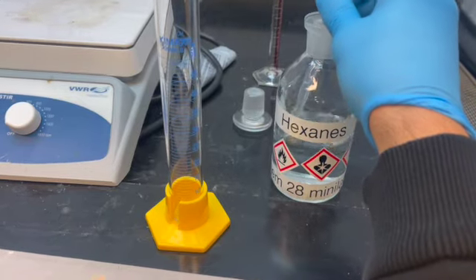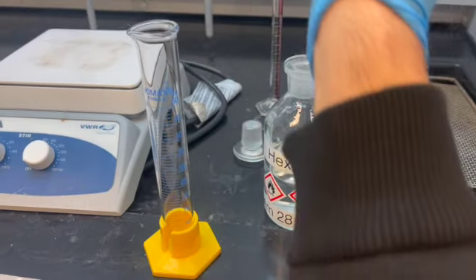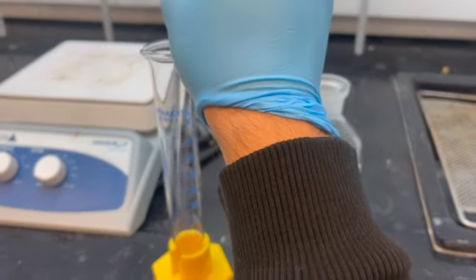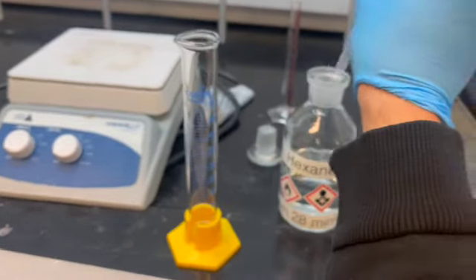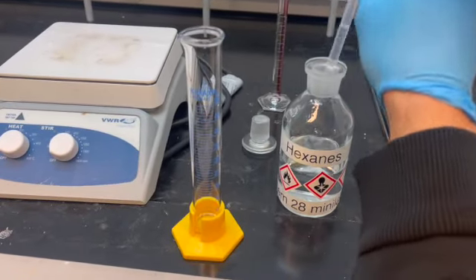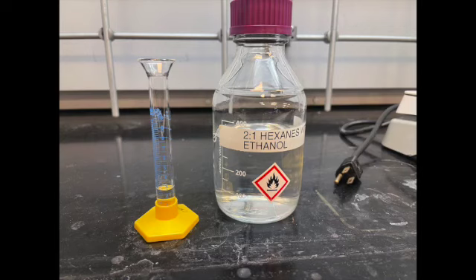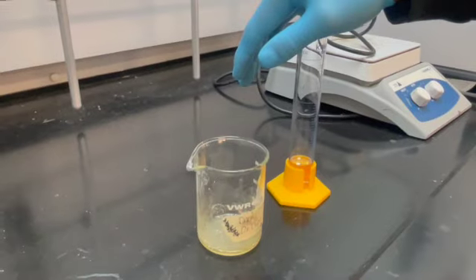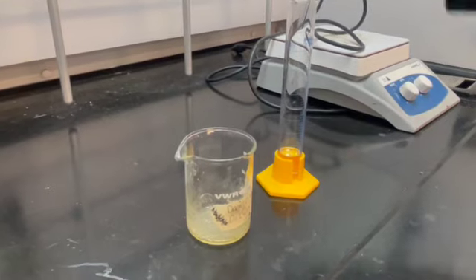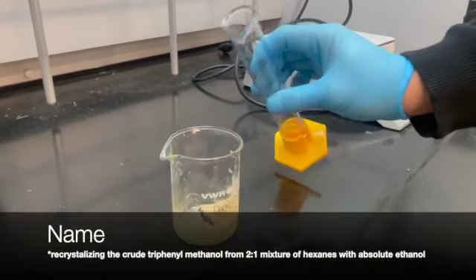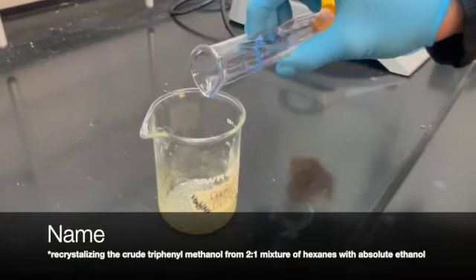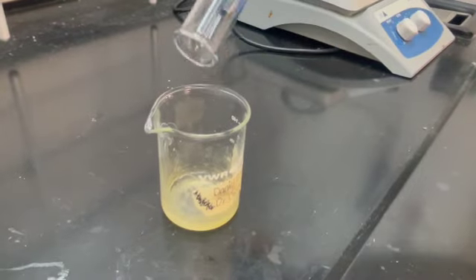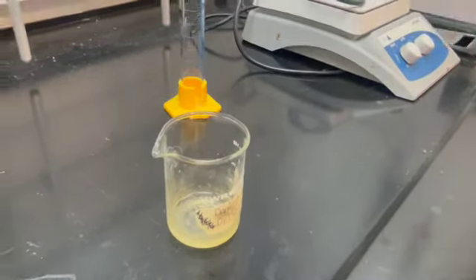We'll be using 10 milliliters of hexanes. We'll measure 10 milliliters. Now we're going to grab the hexanes that we measured, dump it inside our solution, and mix it.